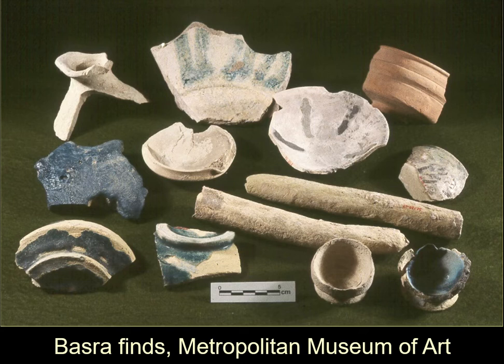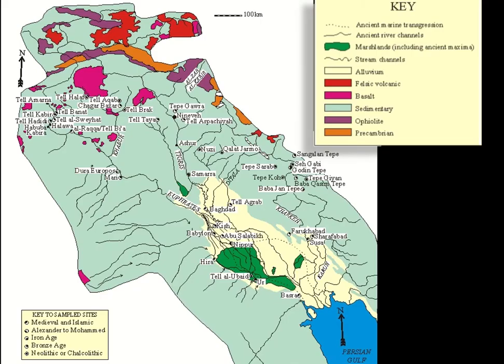What we need to do then is make sure we can also associate it with every other site in the Tigris-Euphrates basin. So that is actually one of the reasons I studied all this pre-Islamic pottery. As I told you in the previous class, we have a major field project in this part of the world, so I was working on this for that reason, and I had a colleague working on Tel Hadidi who wanted to do petrographic analysis, and so we did some pottery from Tel Hadidi.